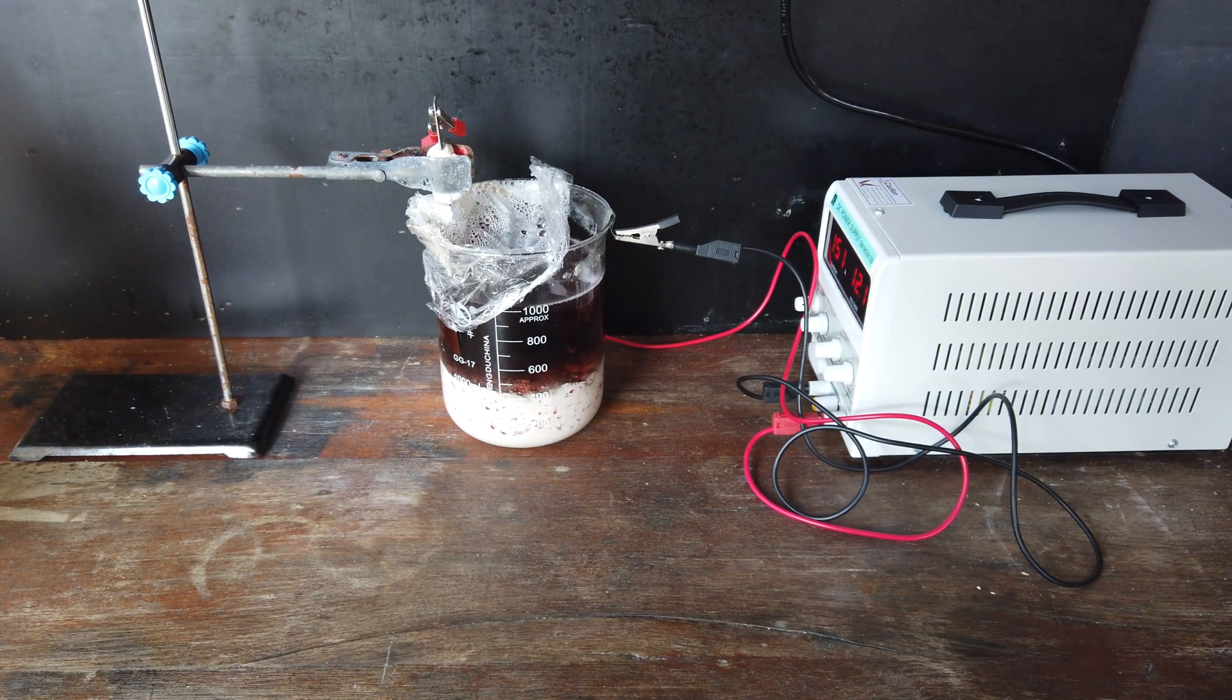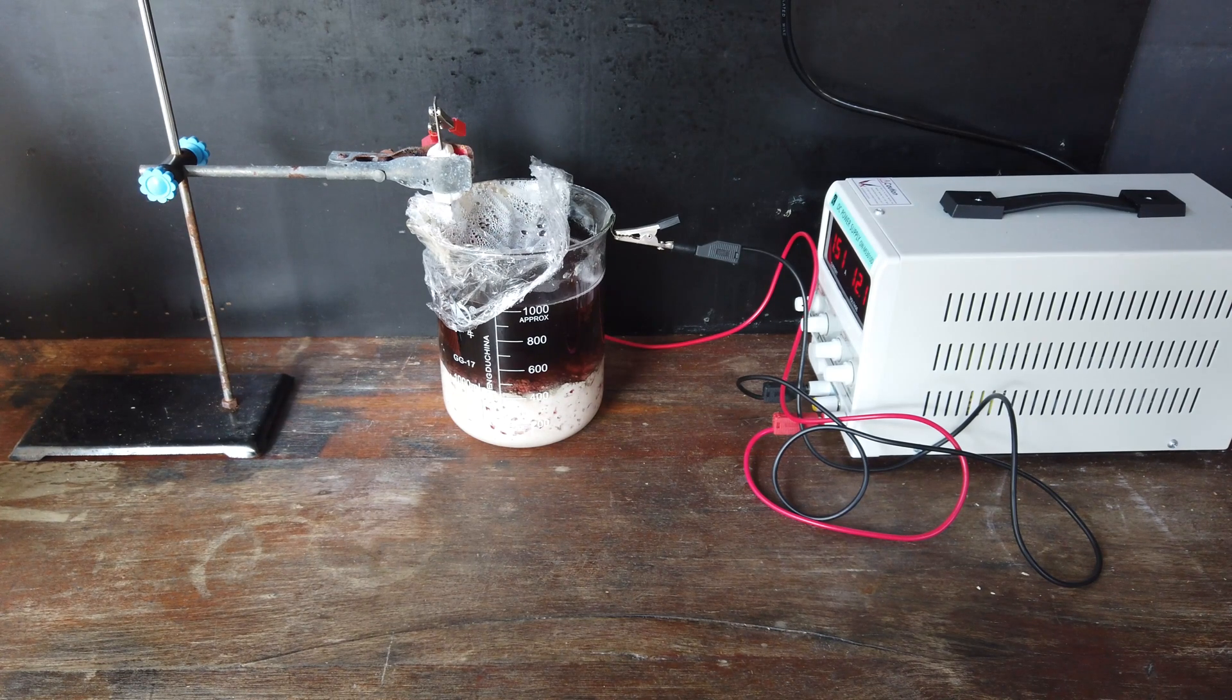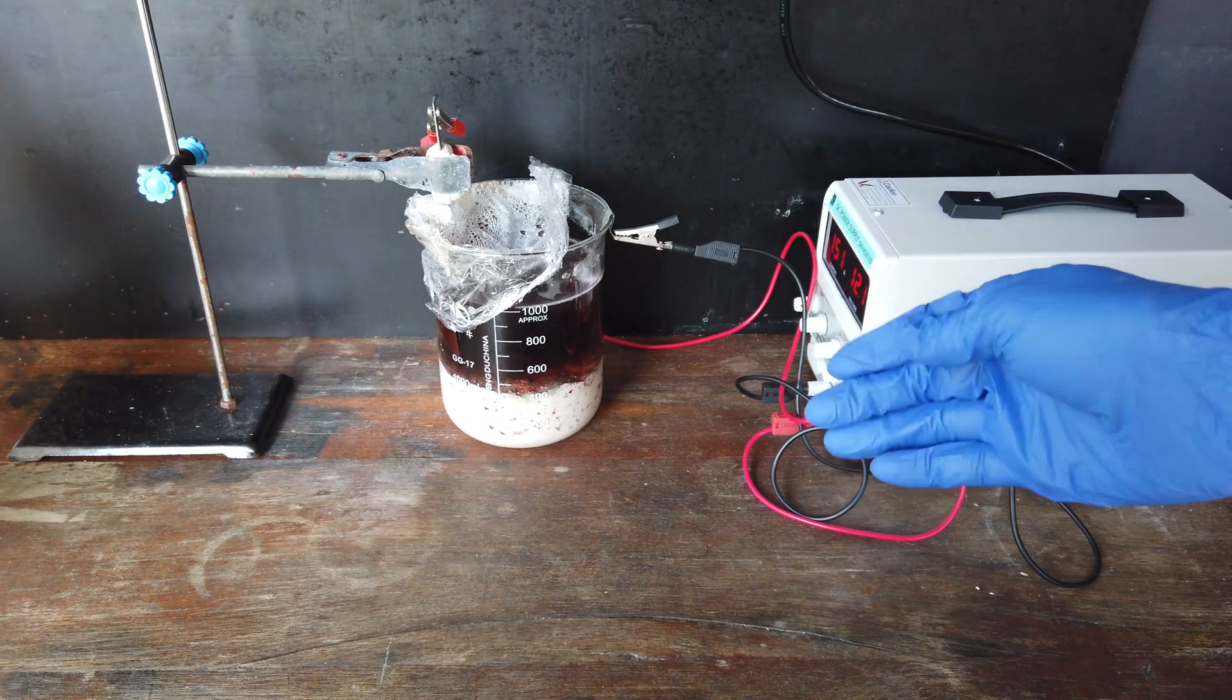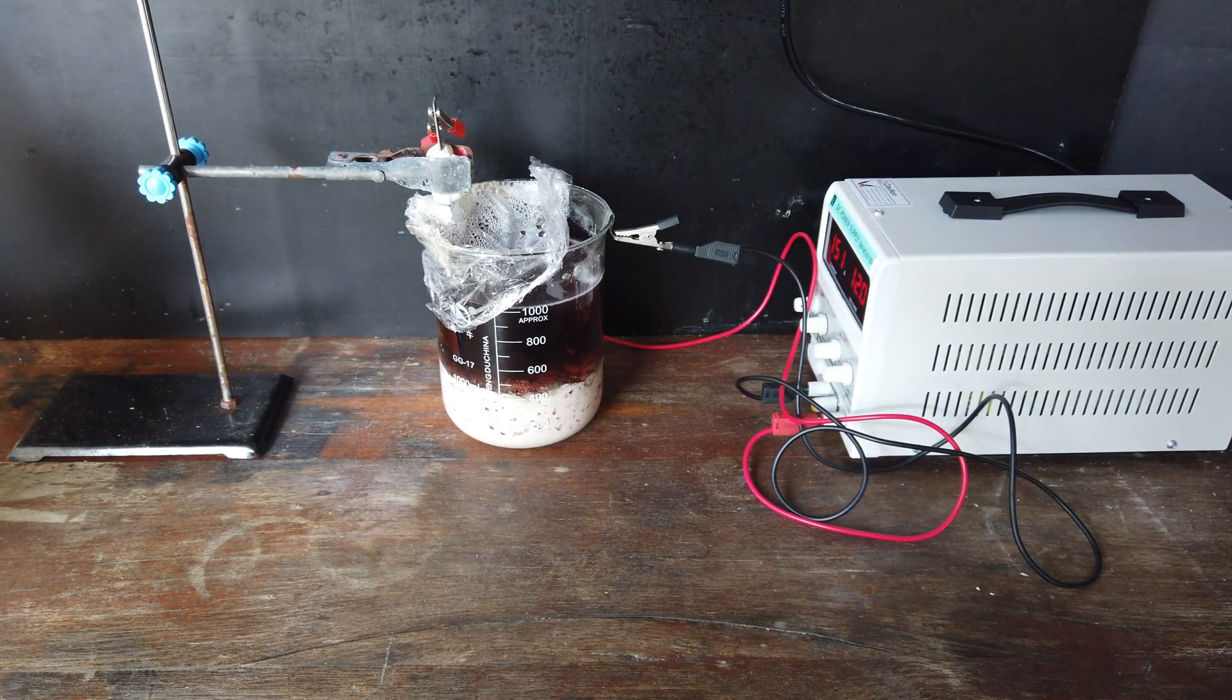But now that everything is proceeding nicely and we can see it is slowly working. It's not very efficient, but it is working. I'm going to leave this going at 1.5 amps for however long it needs to electrolyse out most of that cobalt and nickel.